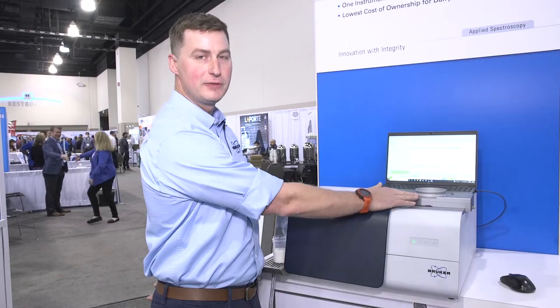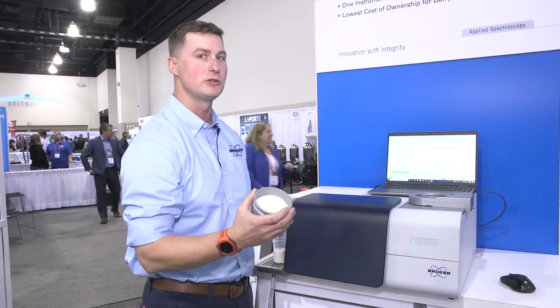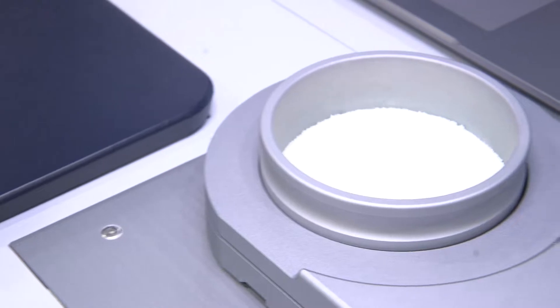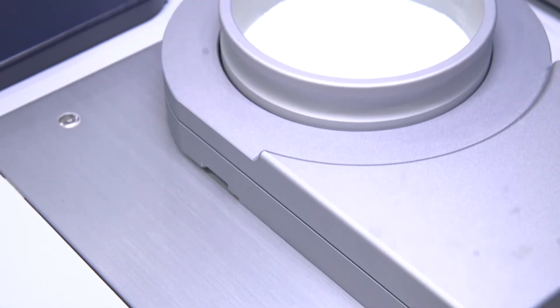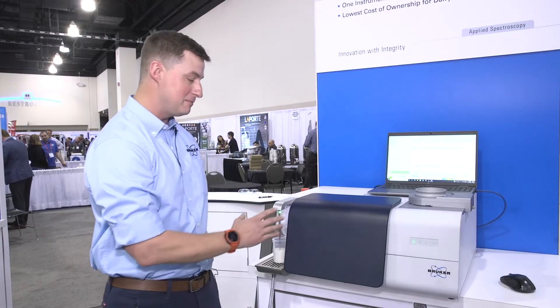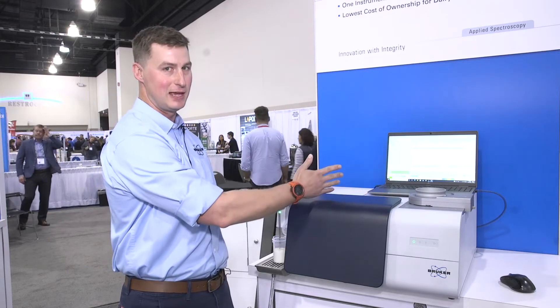On the integrating sphere, this is where we measure solid samples. In this case I have some milk powder, but this is also where we would measure cheeses, yogurts, or any type of solid or semi-solid product that you would normally measure with near-infrared. We measure on the right side of the instrument on the integrating sphere, and we can easily move between liquid channels and solid channels on the same software.